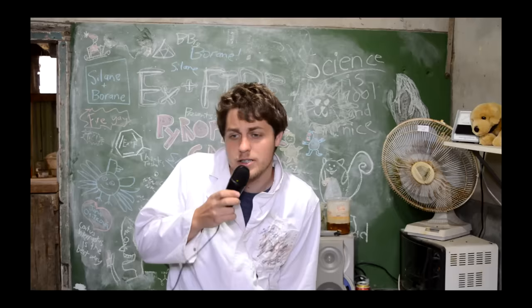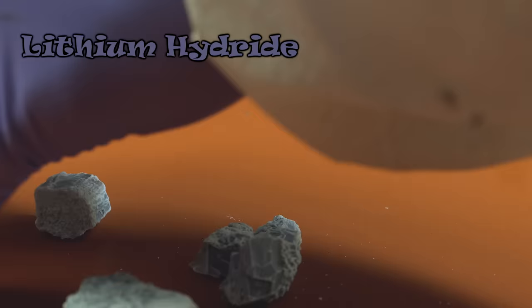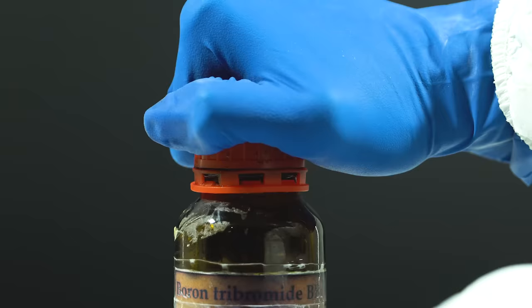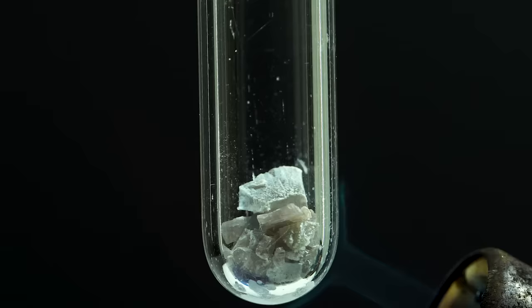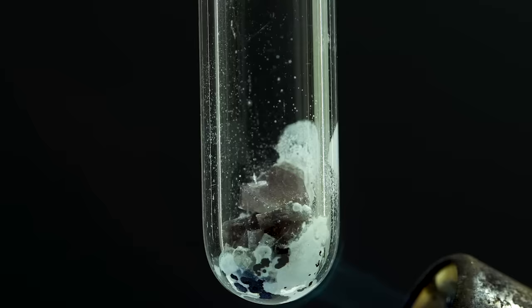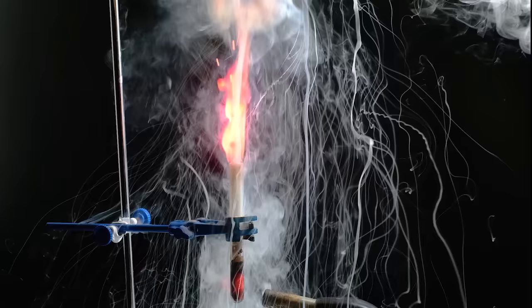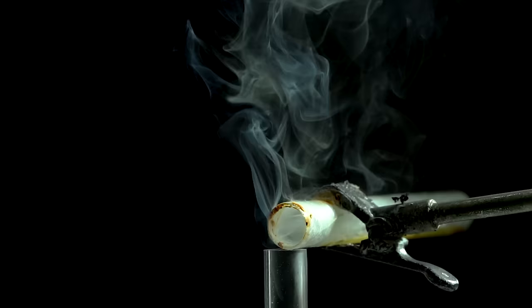Chemical Force said he had one other way of generating diborane by reacting these huge rocks of lithium hydride - that's a cool chemical - with boron tribromide. This is madness. For this reaction, he's going to melt the lithium hydride in the test tube and then add the boron tribromide in through the top. This generates a lot of diborane very quickly. Of course the diborane is very hot, it's been generated very hot, so it's way way above its auto-ignition temperature, so it burns with this beautiful, beautiful green flame.